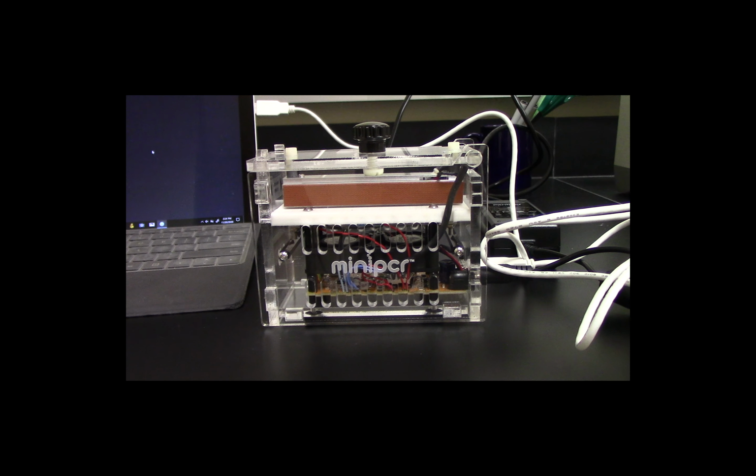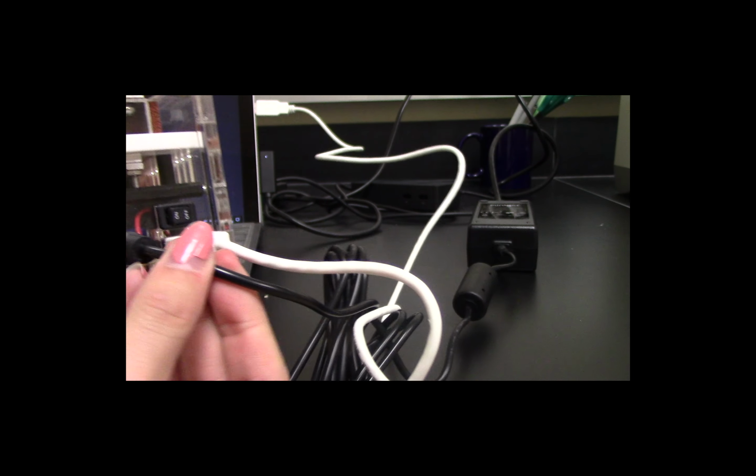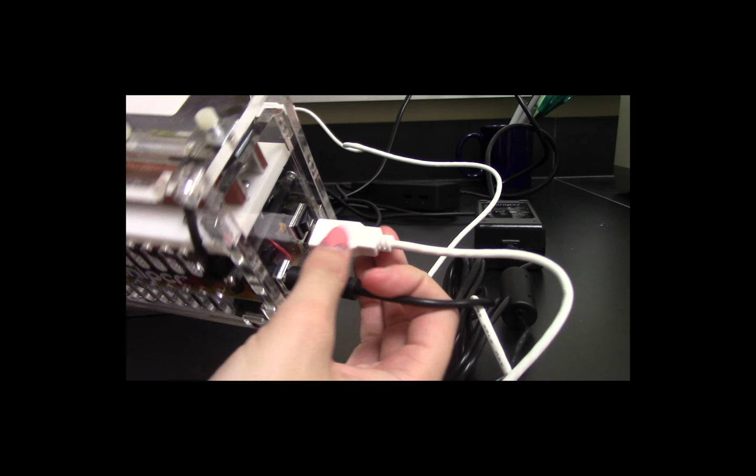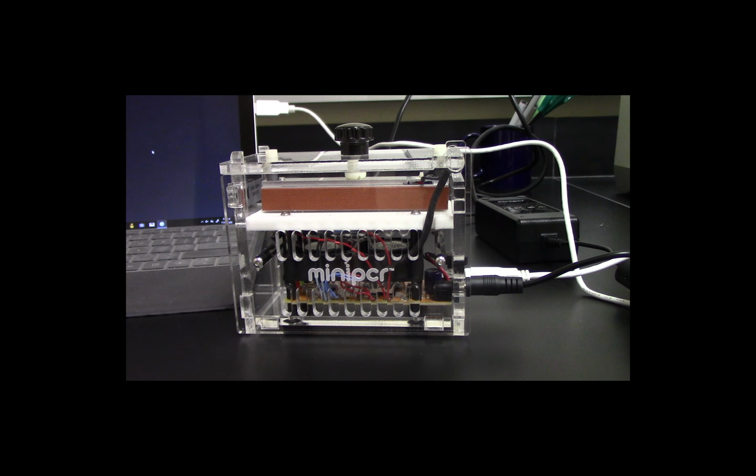Hello everyone, my name is Abby and today I'm going to be walking you through how to use the MiniPCR. So this is MiniPCR number 8 and I have it plugged in for power, and then I also have it plugged into the computer. And now I'll show you how to program the MiniPCR program on your computer to run your PCRs.